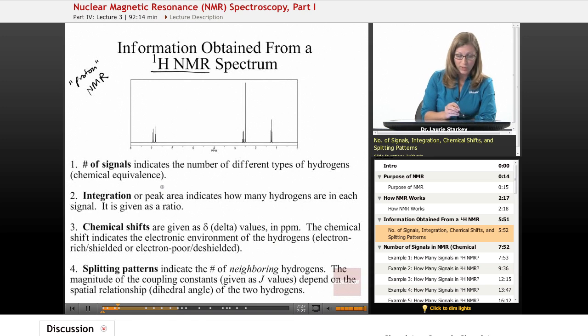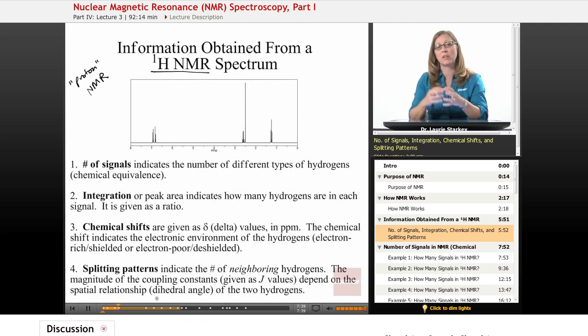And finally, we're going to look very closely at the peaks and the shapes of those peaks to identify what's known as a splitting pattern. Is it a single peak? Is it split up into two or three peaks? That's going to tell us something about the neighboring hydrogens on the structure. So you'll see we're going to be able to put our pieces together depending on these splitting patterns, and we'll explore each of these one at a time.